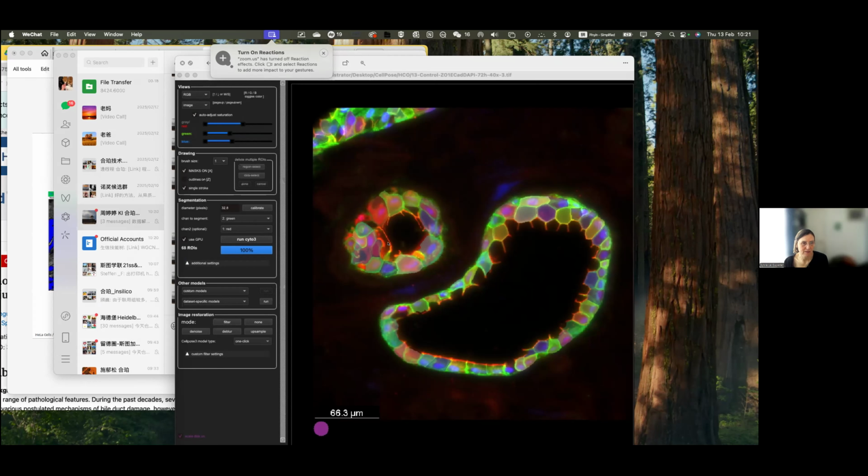Yes, I use Cellpose to do segmentation on the organoid slides, but the result is a bit weird. For example, there are no intact cells on the edge of the organoids, but sometimes it puts a mask on that. But sometimes, look here, there is a cell here, but there's no mask on that. So the result and the real situation are different. How can I adjust that?